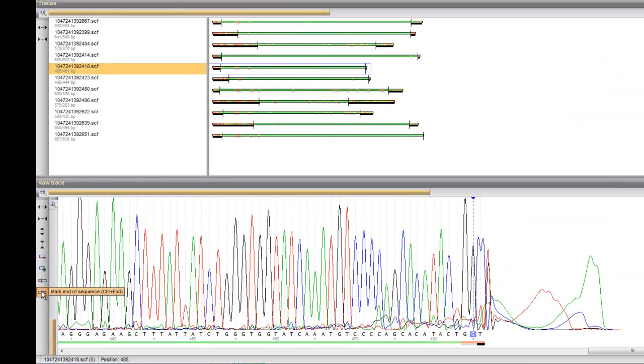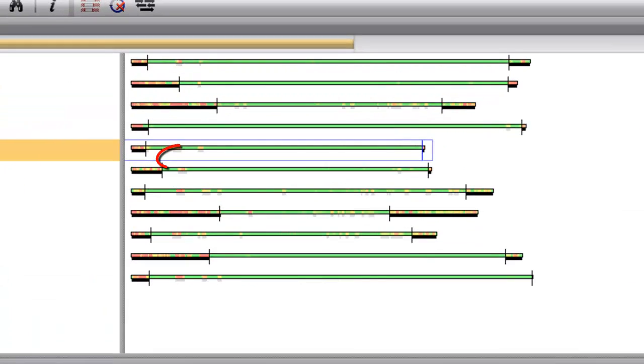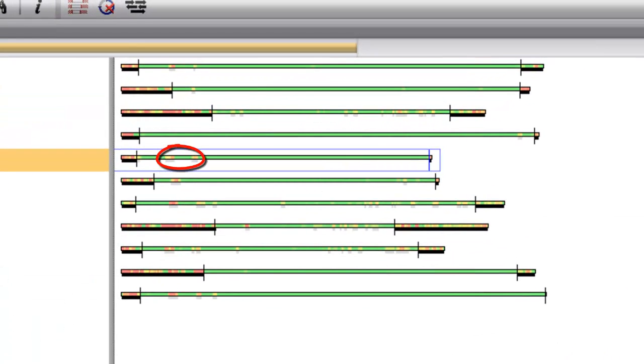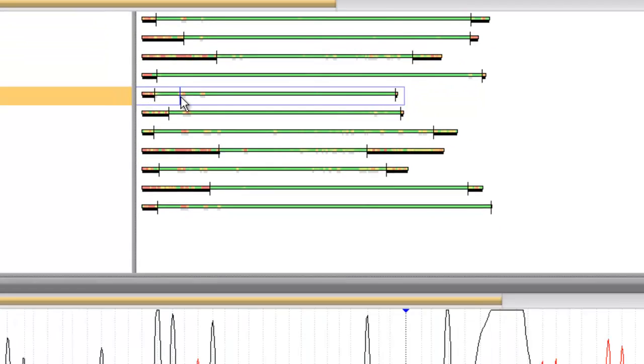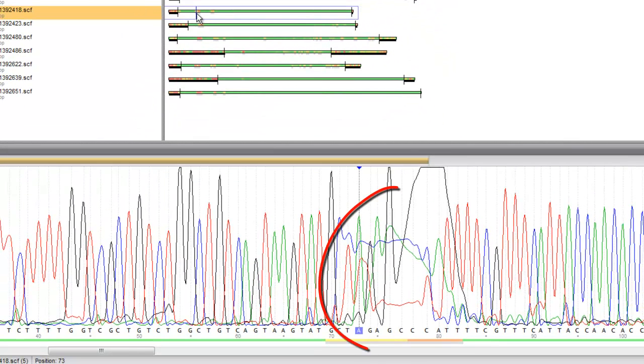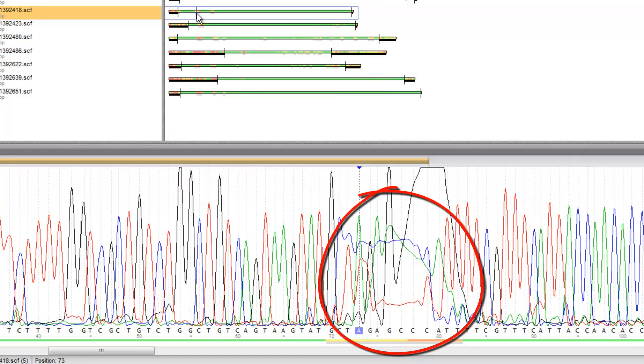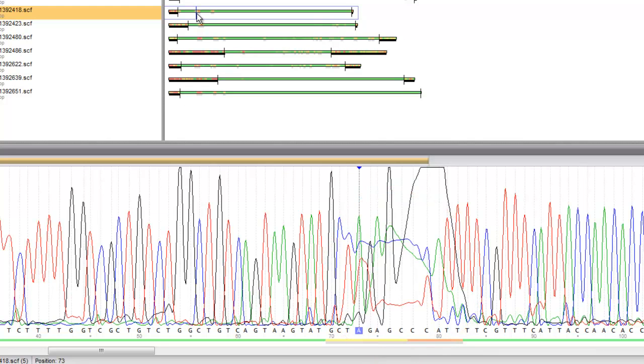Inside the sequence, there also may occur regions of less quality. These are indicated by a yellow or orange color and are underlined by a gray bar. This gray bar defines an inactive zone. Inactive zones will only be included in the assembly if there is no other partial sequence of better quality available for that same region on the gene.